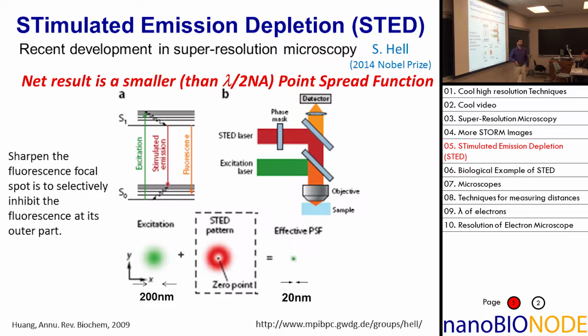That I don't know. Though apparently making this phase mask is a standard photolithographic technique. I don't know. Okay. Yes. So can you play with the size of the phase mask to get a smaller PSF? No. Pretty much this phase mask is sort of set. And so the effective size of this hole is set.